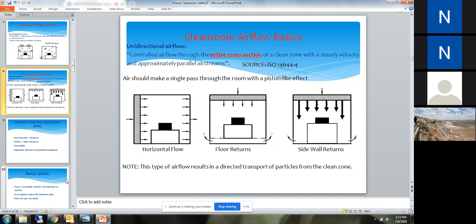So if this is your PECVD or whatever equipment, it's hooked up to a chiller, it's hooked up to a pump, it's hooked up to oxygen, it's hooked up to nitrogen, it's hooked up to everything. Everything that is hooked up to this equipment is on the sides here, because these cylinders and the pumps all outgas, they are dirty.